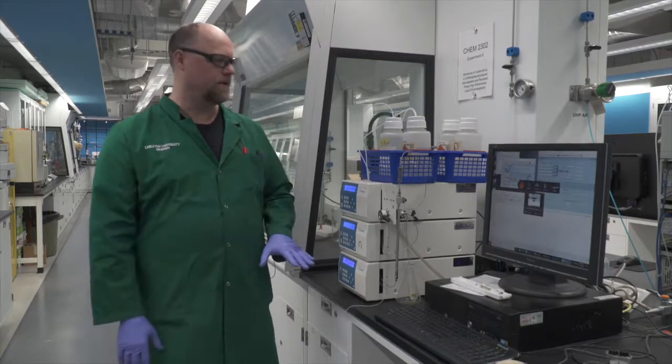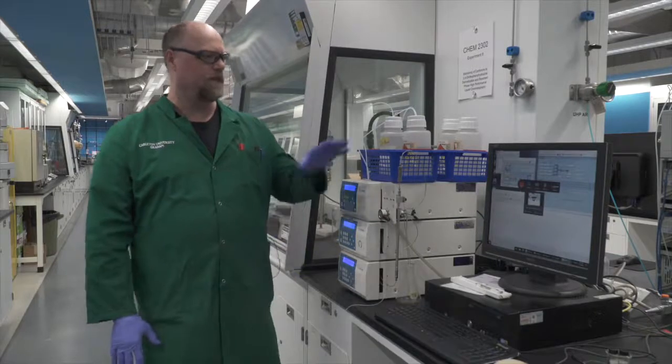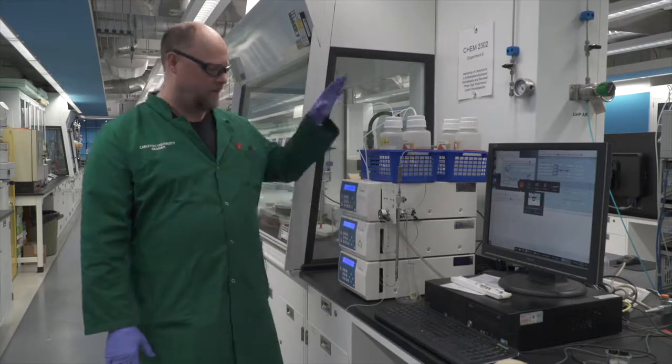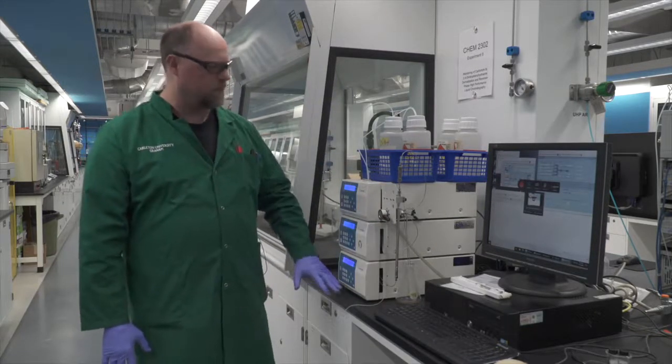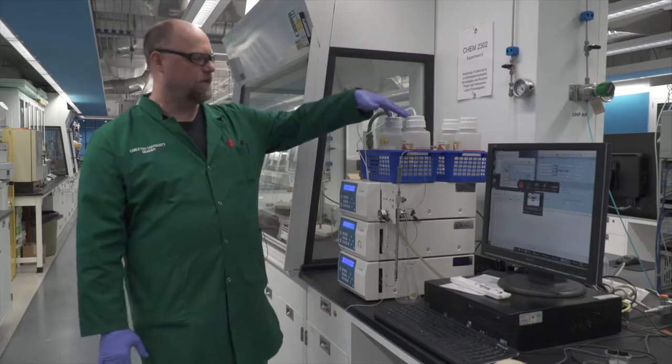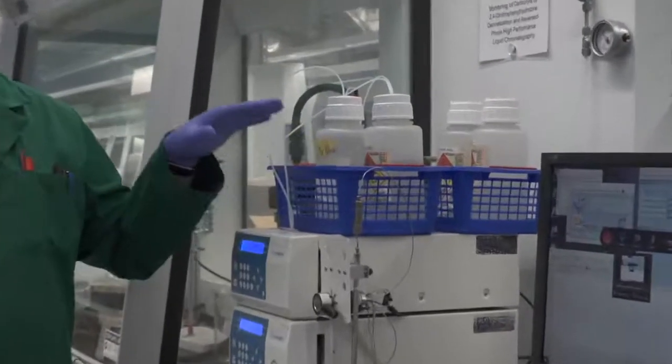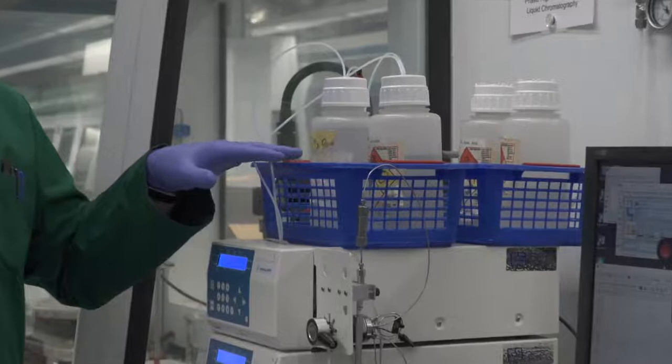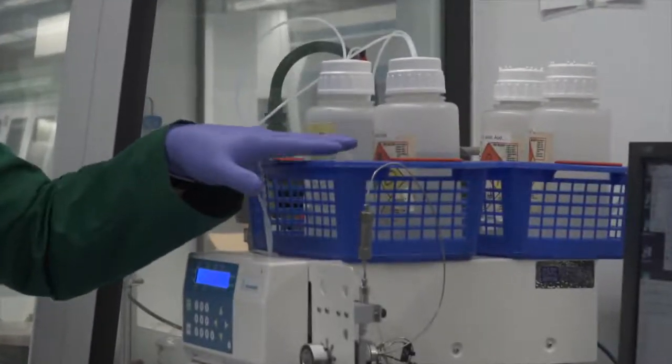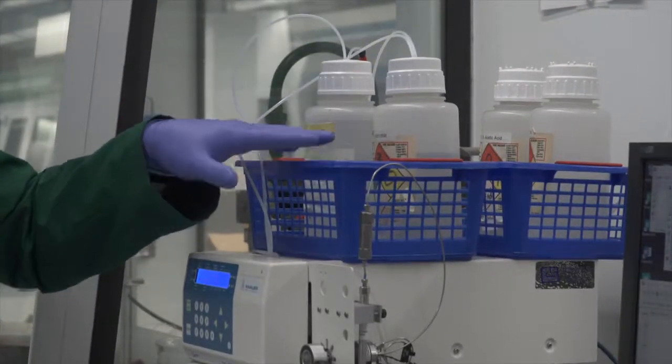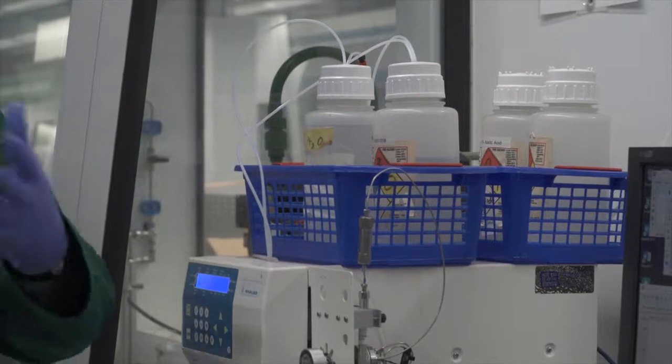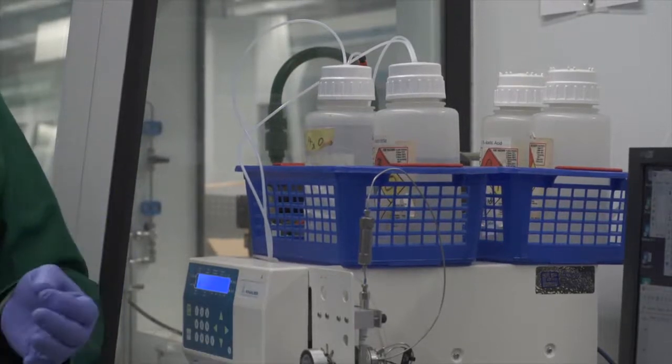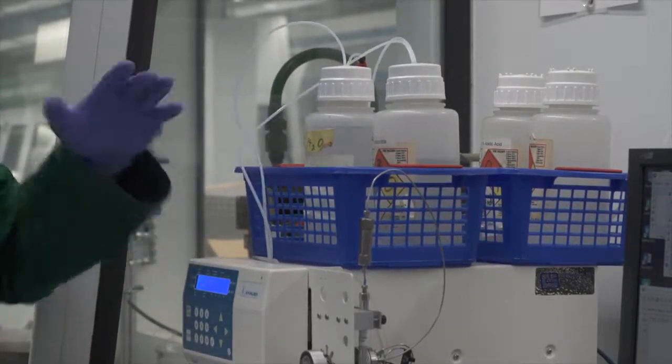The first part of the instrument that you need to be aware of is the computer and then this stack of instruments. On the top we have the reservoir bottles. One of the things you'll want to do when you come into the lab is to make sure that the reservoir bottles that are connected to the instrument are the ones that you're going to want to use. Most of the time this will be done ahead, but it's always a good thing to check before you use an instrument.